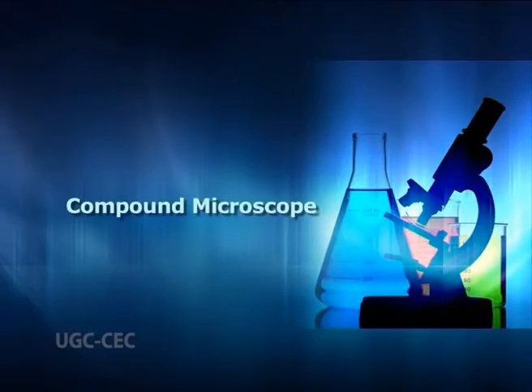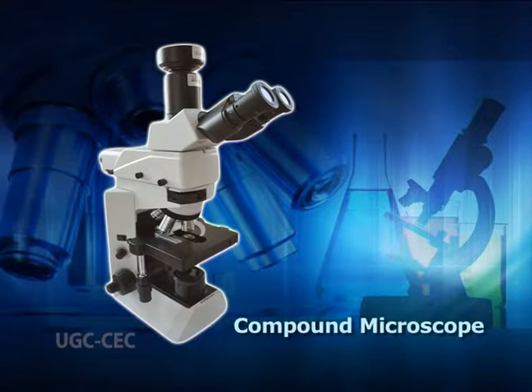Compound microscope. The most commonly used microscope and the integral part of a school or college lab is the compound microscope. This compound microscope uses two optical parts called the eyepiece and the objective lens. The compound microscope can provide up to 1000 times magnification with photography zooming.